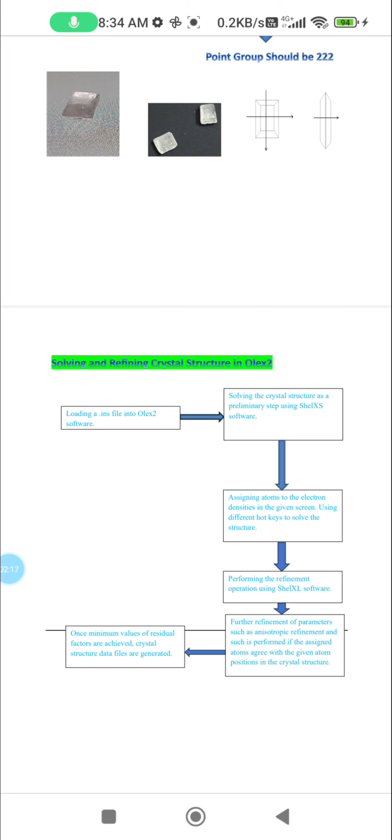Also, you can use the mplane command to form the plane on the molecule. It looks quite beautiful with this command. The molecule starts looking very nice.